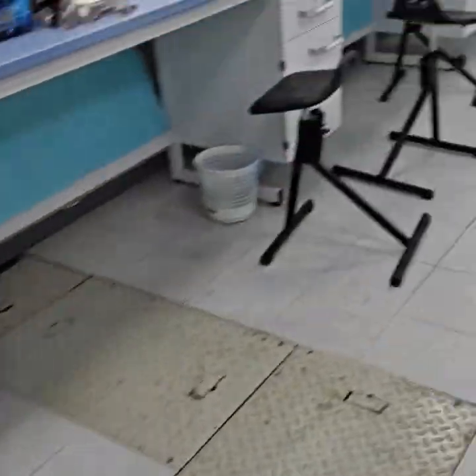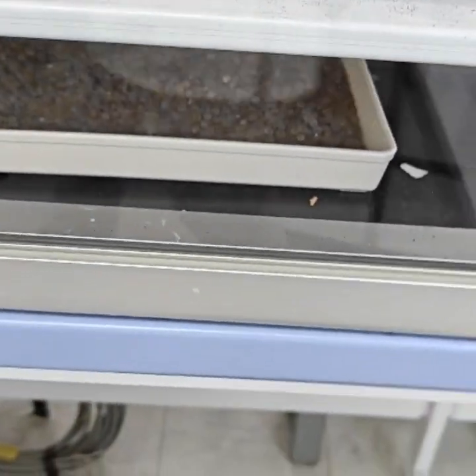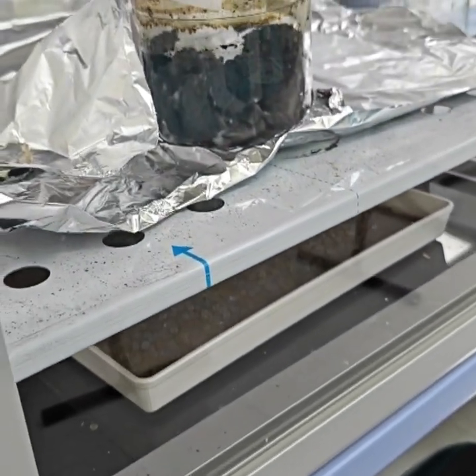Okay, so you can see here, this is our desiccator, and make sure the silica gel at the bottom should be completely blue, not white. So this is now white. We will change our silica gel.